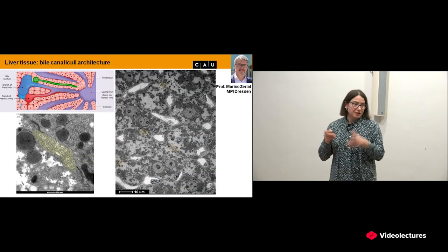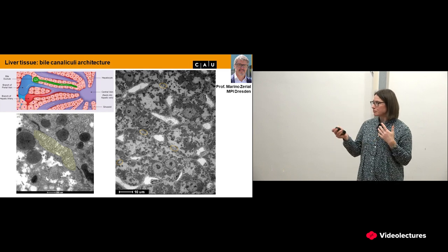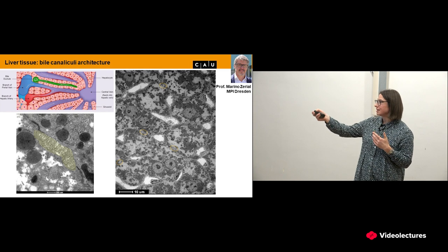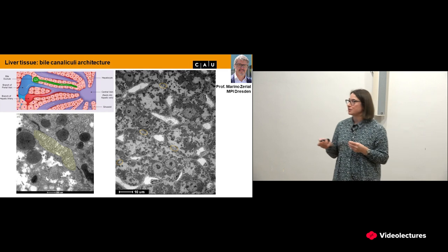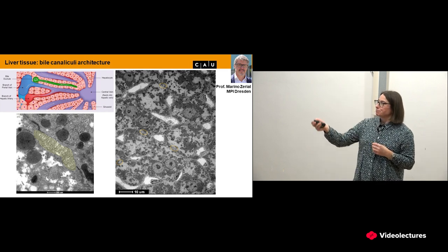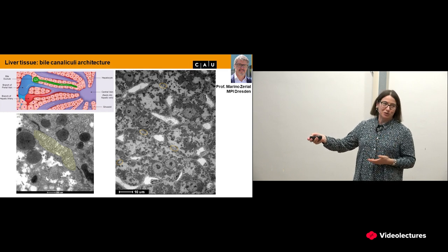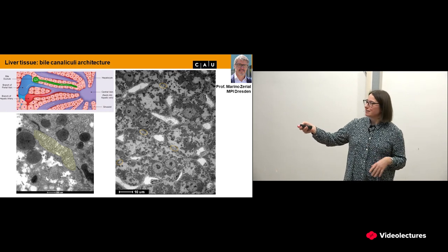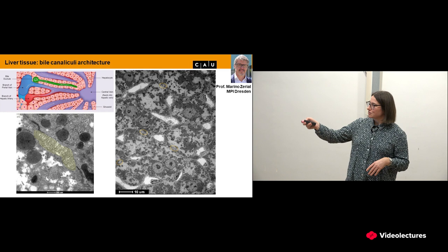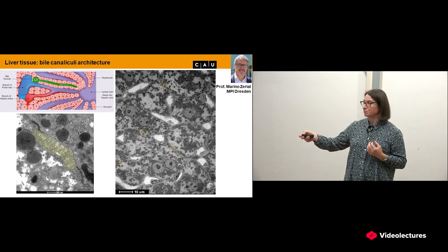And I will go a little bit extra and just show you the project I did in MPI Dresden. This is Professor Marino Zerial. He is now the director of the Human Technopole Institute in Milan. He is interested in liver and in endosomes. Sometimes he's called Mr. Rab5, for all those who know membrane trafficking. So in the liver tissue, his interest is the apical membrane, the bile canaliculi, because they are formed by apical membrane.